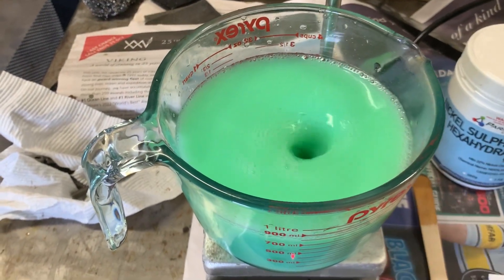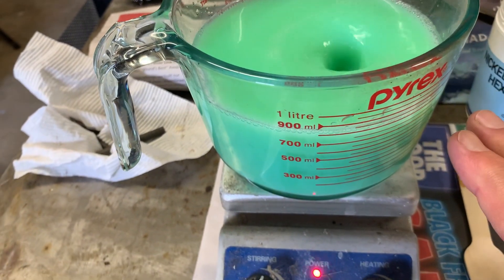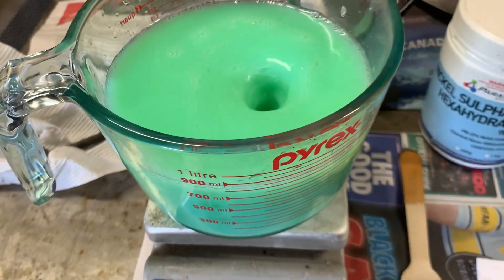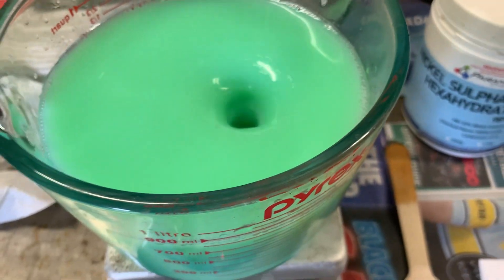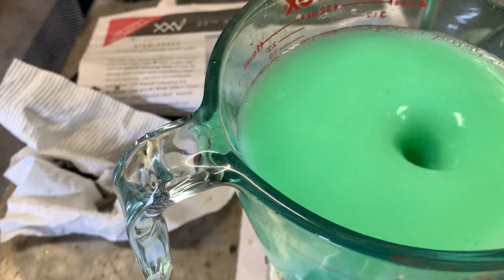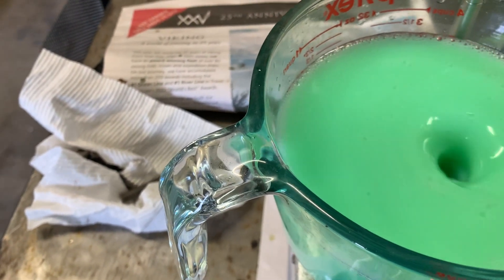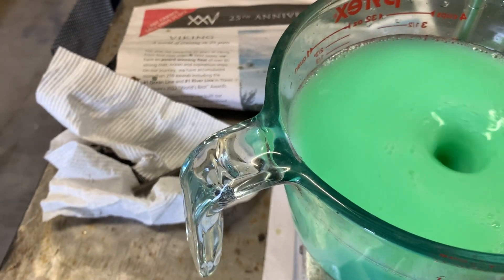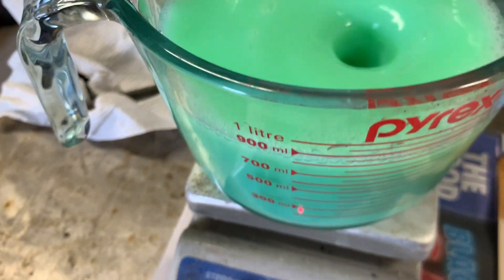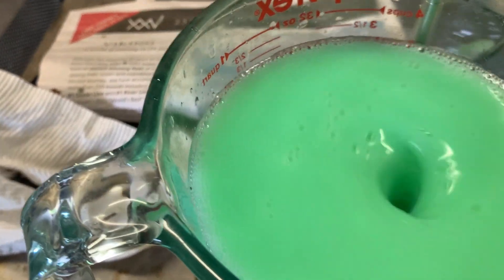Once this is all stirred up for an hour, let it settle and then siphon off the liquid into another container and put that aside to evaporate. It's best to do this in summer — it goes a lot faster. Then add some water — I just use tap water for washing. Wash it about four times by filling it up, stirring it all up, letting it sink, then repeating. You should then have some clean nickel hydroxide.